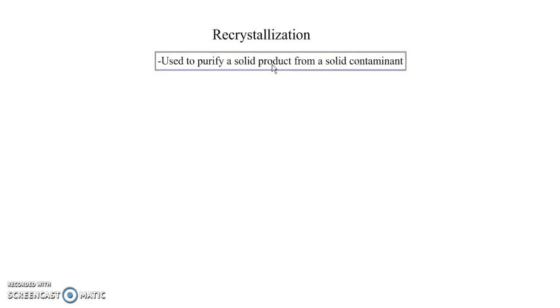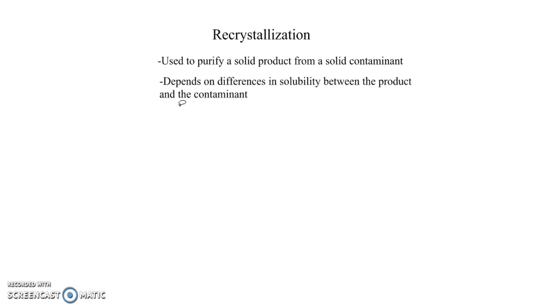I want to talk today about a purification technique called recrystallization. It's used when we have a solid product that's contaminated with some sort of other solid that we want to remove from it. It depends on differences in solubility between the product and the contaminant.